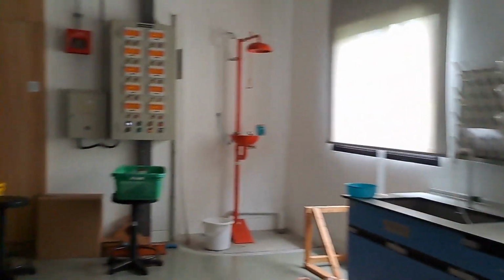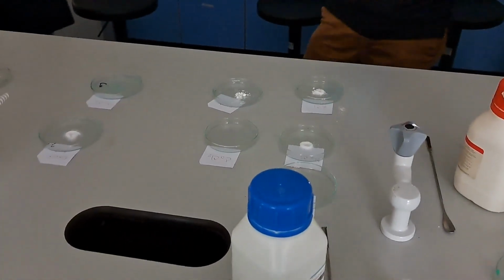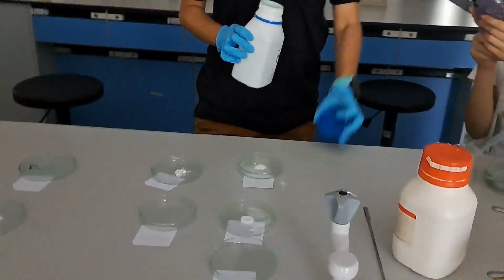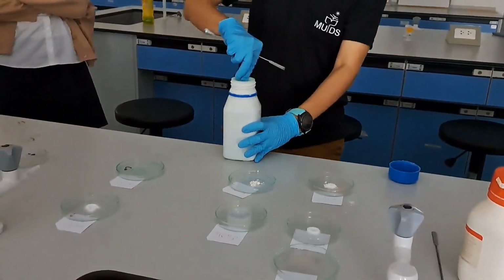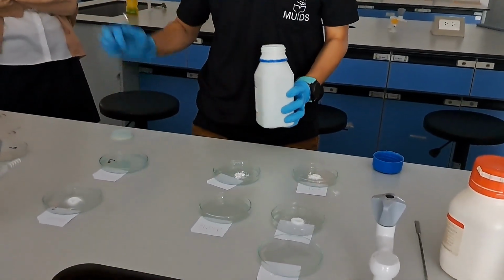And the last demonstration is on that table. Alright, this is very Instagram friendly. I have to set some of it up on the spot because some of the solids here are absorbing water, so it will take time.